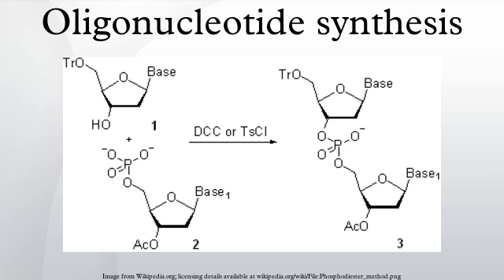History. The evolution of oligonucleotide synthesis saw 4 major methods of the formation of internucleosidic linkages and has been reviewed in the literature in great detail. Early work and contemporary H-phosphonate synthesis. In the early 1950s, Alexander Todd's group pioneered H-phosphonate and phosphate triester methods of oligonucleotide synthesis.